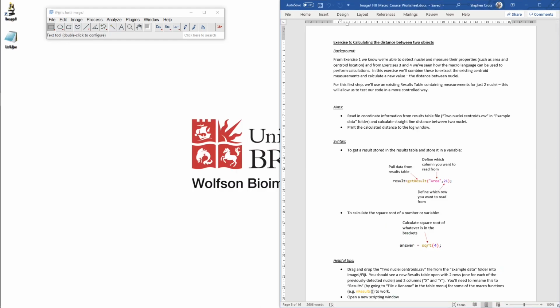So at this point, you may be wondering how all of these different exercises will fit together. Just rest assured at this point that they will do later on. However, for now, we are going to continue looking at the individual practical components. So the next one we want to look at is effectively enhancing the functionality of our macro by introducing new calculations.